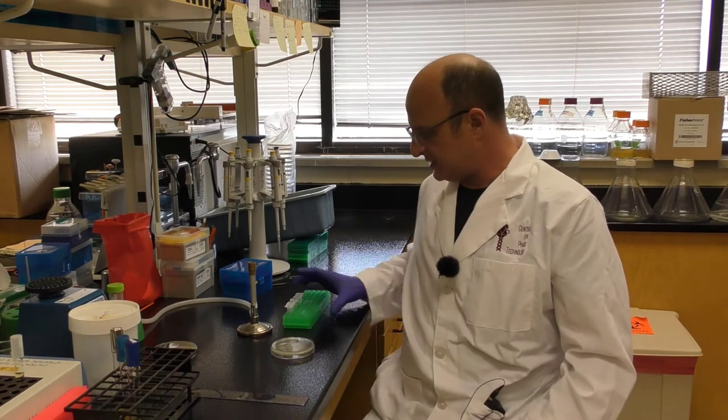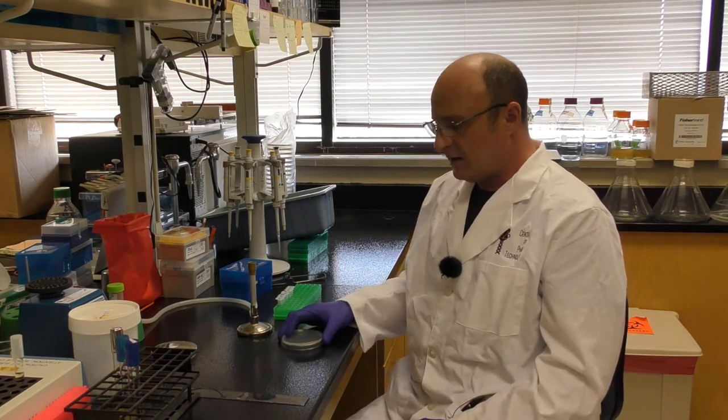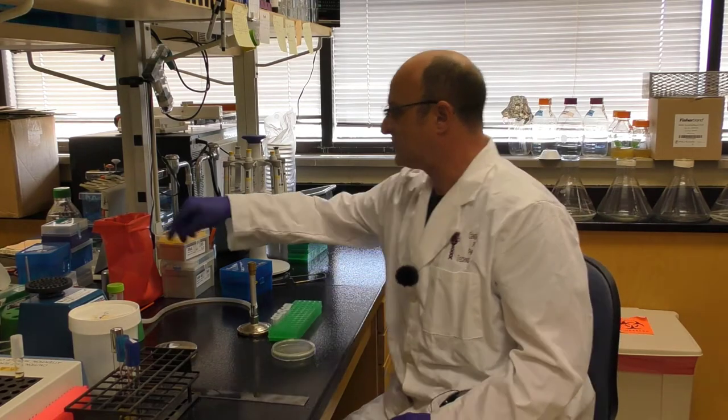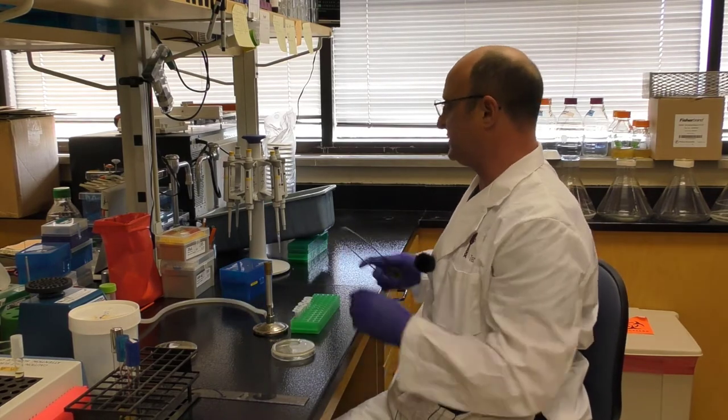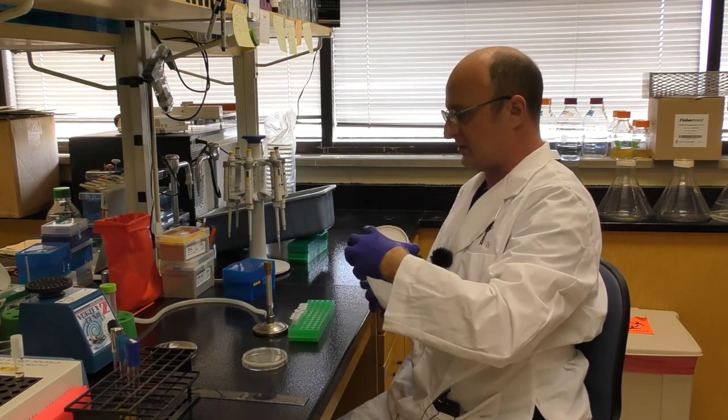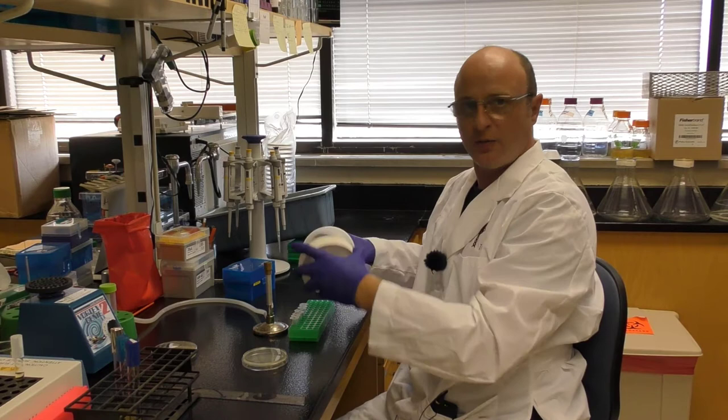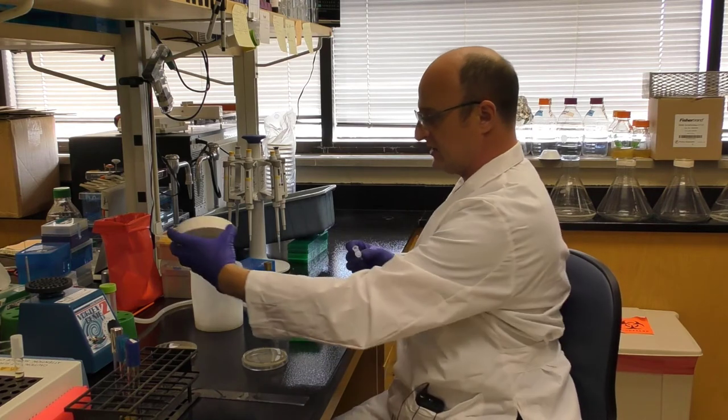The next process I'm going to show you is the whole plate titers. It's a very different process but it's pretty straightforward. I'm just going to show you one, but in most cases you're going to be doing several different dilutions. Because of course you don't know the titer up front, so you don't know which plate is going to give you the isolated plaques that you're looking for. First thing we do is we take our plate, start our flame, making sure it's safely located and our working zone has been sterilized. We will take a 1.5 mil tube that we will set up each reaction in. Normally you'd be doing several different dilutions at the same time. So I take a single tube. I'm going to do whole plate titer, just this minus 5, 10 to the minus 5 dilution.